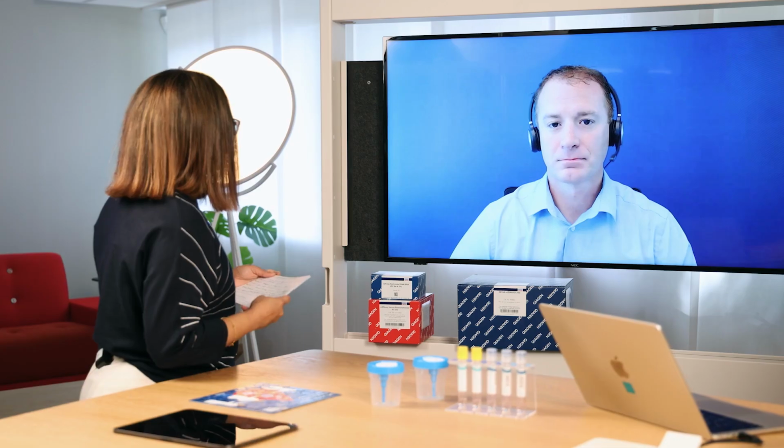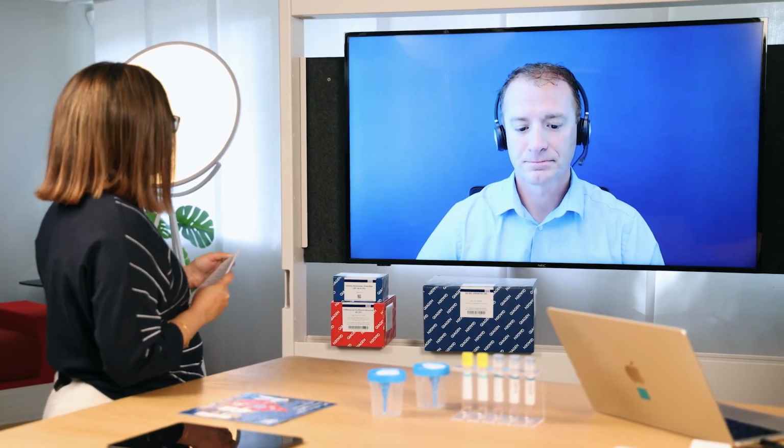So, multi-analyte analysis from start to finish. Can you give us a little synopsis for our audience, Jonathan? I'd be glad to. You first start with 2 PAXgene cfDNA tubes, and you isolate your nucleic acids for both DNA and RNA.